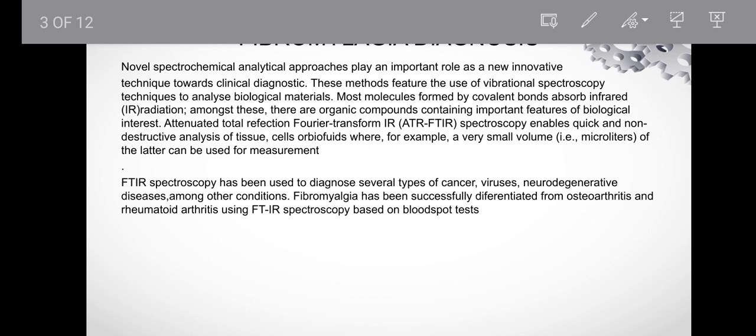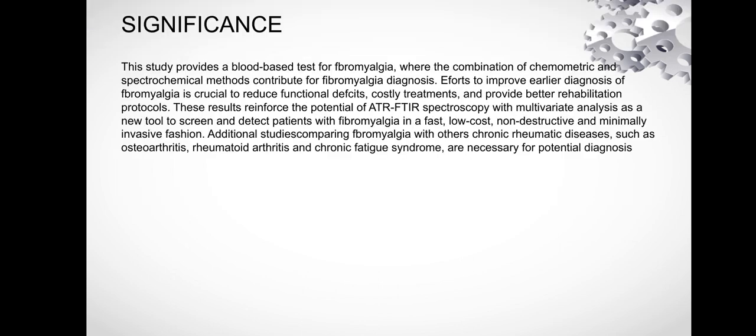So moving on. 10 milli of blood was collected from each patient on the same day. Also, for all patients, that means 252 people, all the blood samples were collected, 10 milli of blood sample. That's one of the major advantages, like we only need a small amount of sample for our diagnosis.